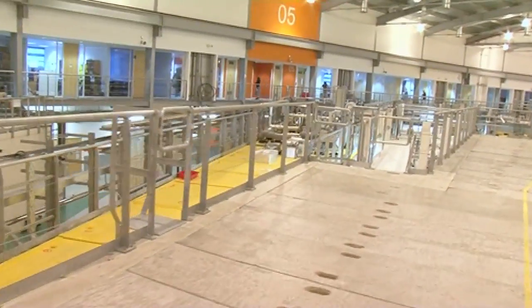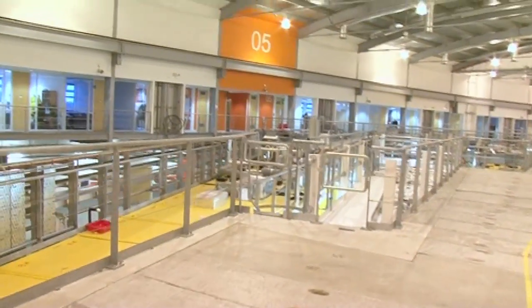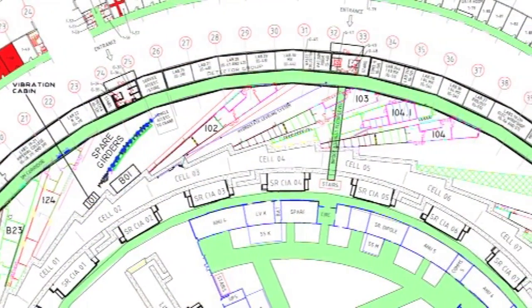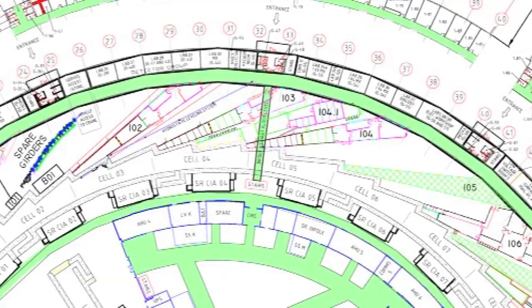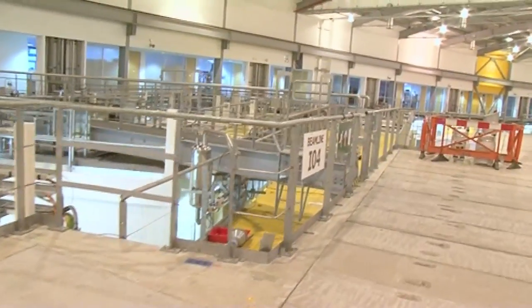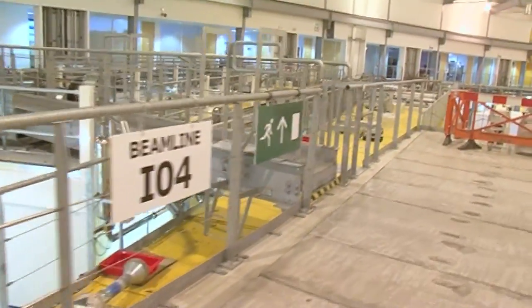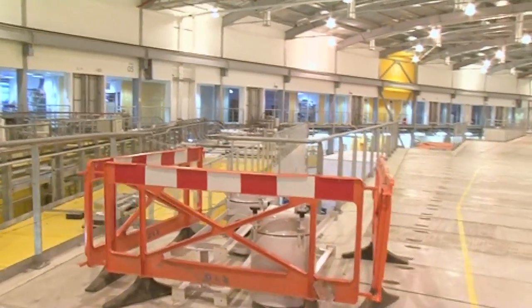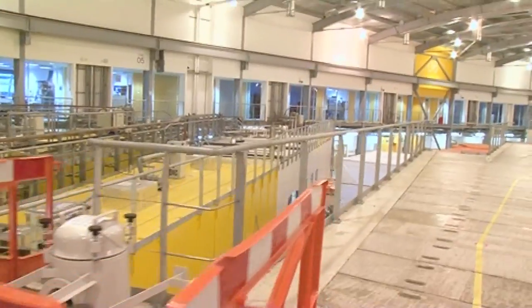Here we're entering a range of beamlines that all do techniques called macromolecular crystallography. This is where we look at the structure usually of biological materials, perhaps proteins, to understand how biological processes work. It's very useful for drug discovery in particular — understanding how these biological processes happen and how we can treat them.